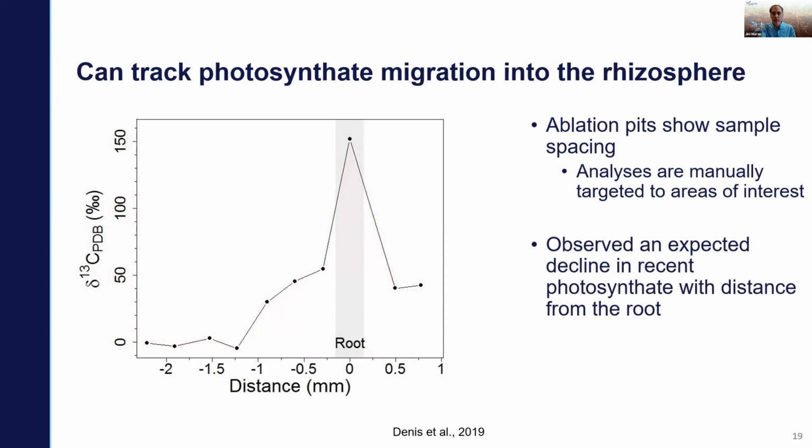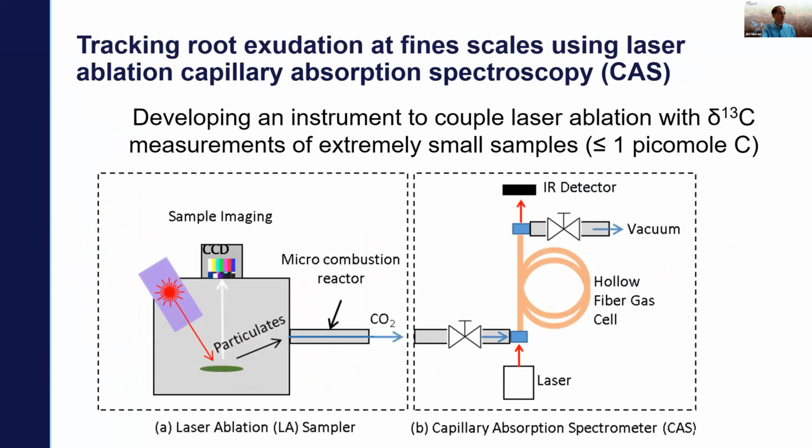How much carbon is going to the rhizosphere in different sections of the root, or when the root is put into different conditions. Now, this is really great. I think we're getting on the order of probably 75 to 100 micron spatial resolution when we do this. But I also want you to understand that EMSL is always trying to push the limit, right?